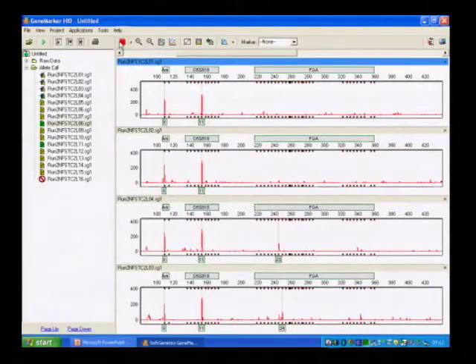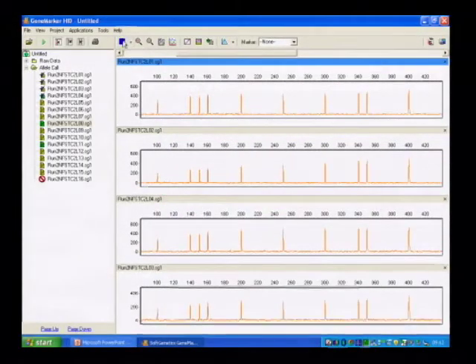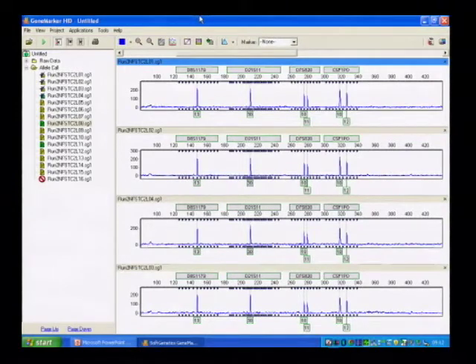Yellow is starting to get noisier and the alleles are still present, but some of them are not called. Then red, and the sizing standard. So that's the analysis from the fast run that we performed yesterday. And that's typical of what one would get out of GeneBench for STR separation detection and then analysis through the software package.